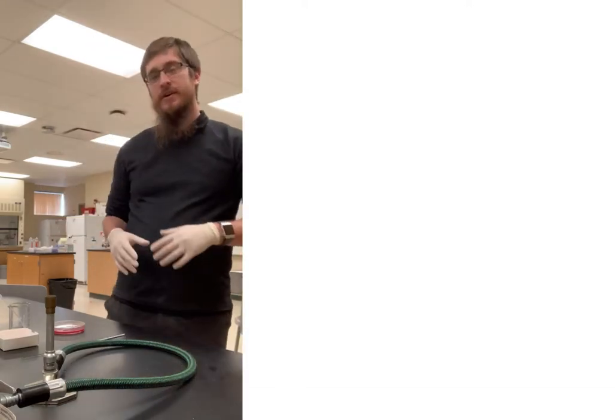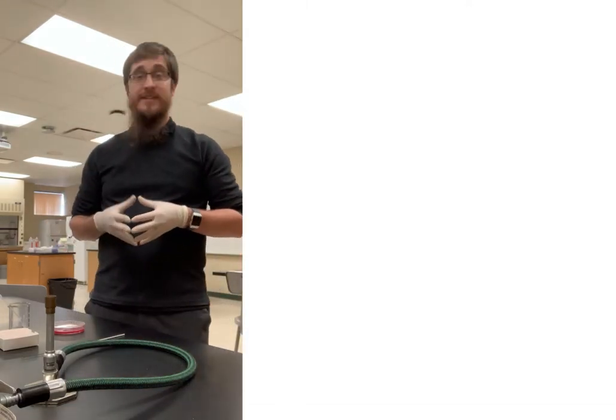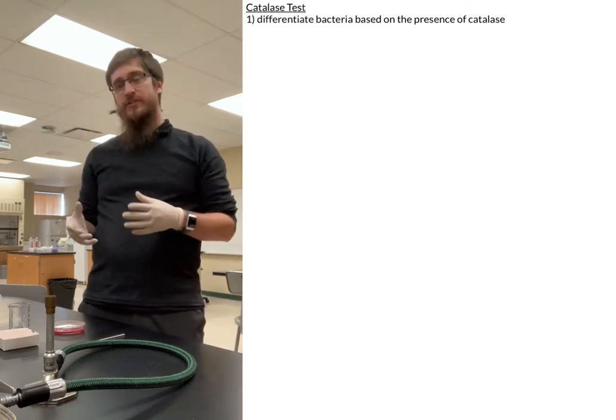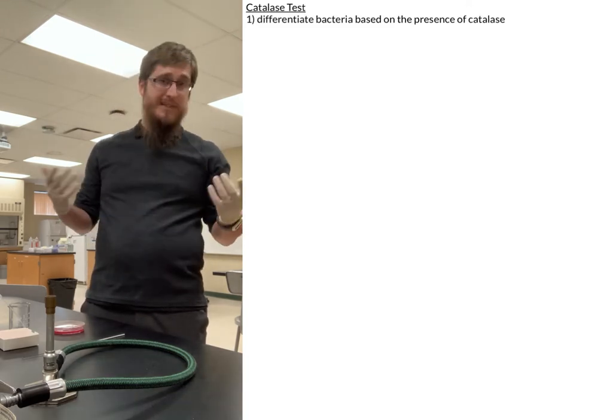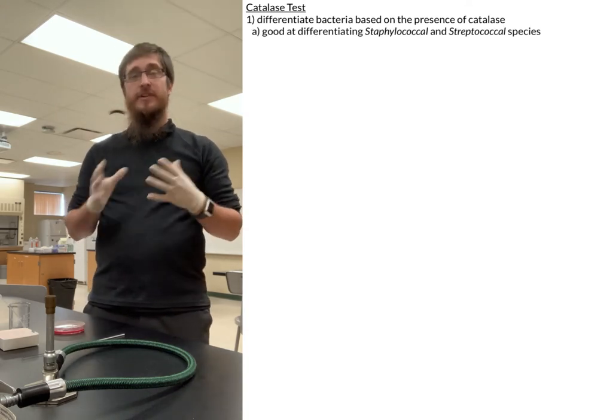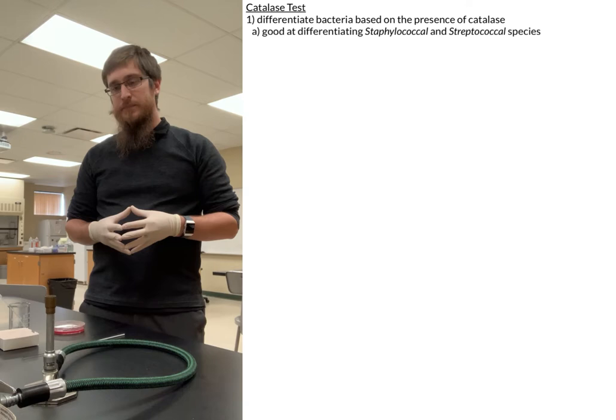Hey guys, today we're going to be talking about the catalase test. The catalase test is used to differentiate bacteria based on the presence of the enzyme catalase. This test is really good at differentiating between staphylococci and streptococci.